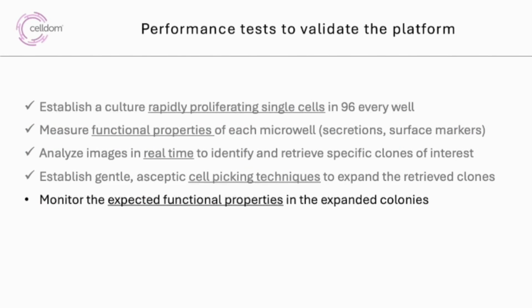So in the final slides here, I will address the most important question in cell line development, which is, do the cells display the properties that they were selected on? In brief, our conclusion is that this question is more related to plasticity of cell memory than it is to any measurement artifact of a cell picking platform, at least in our hands. And this is a natural question to ask, since a cell population is a quantity that continually evolves in time. So in the next few slides, I'm going to show a few examples where memory is retained, and also a few examples where memory is not retained, as guidelines for how one would establish stable master banks of cell lines.